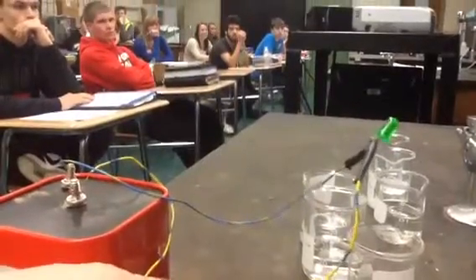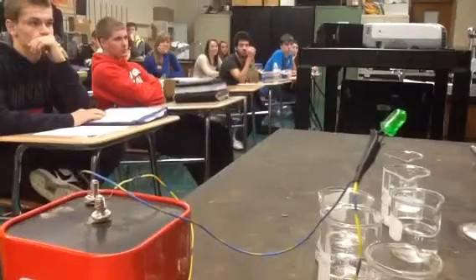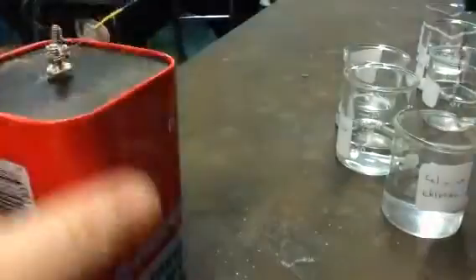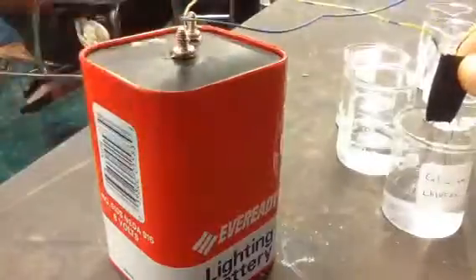Yeah, I'm getting there. The LED lights up. It's hard to see on film, but it lights up when we close the circuit. So if we have a conductive solution, a solution which conducts electricity, then when we stick the ends here into the solution, it ought to light up.